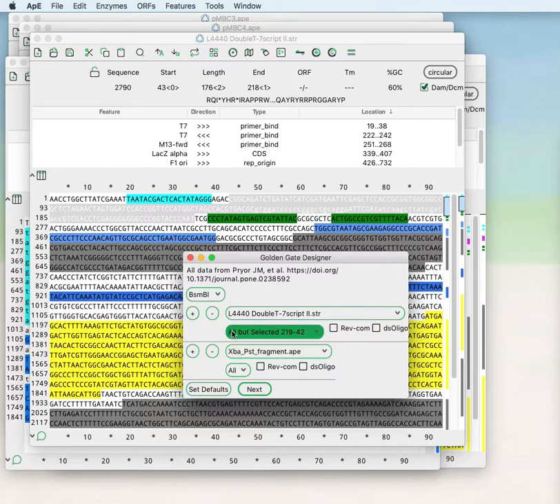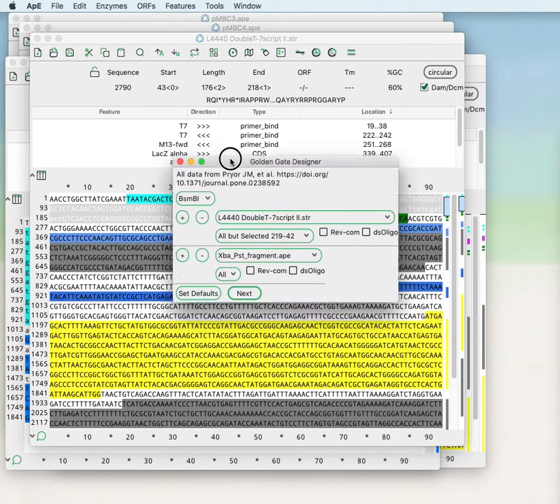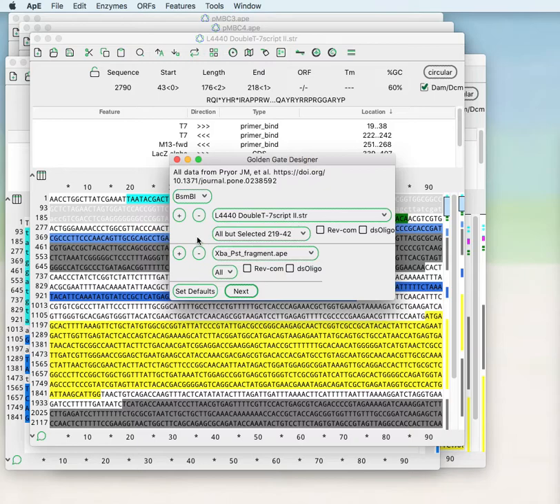You can choose any number of fragments but for demonstration purposes we will just do a two fragment Golden Gate reaction.